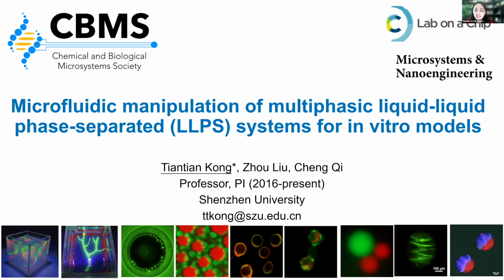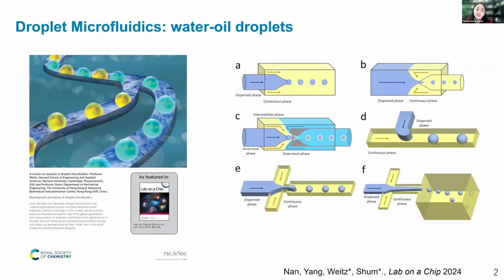My name is Tiantian. Today, I'm very honored to be here to share my work as part of the microTAStic seminar series. On this special day, I'm excited to share our latest work on the fusion of liquid-liquid phase separation and microfluidics. Droplet microfluidics has been around for quite some time, and it is a transformative platform that allows us to create and control tiny droplets with remarkable precision.